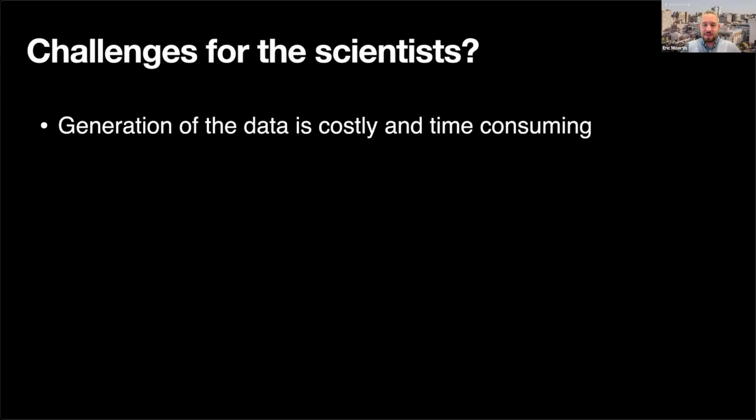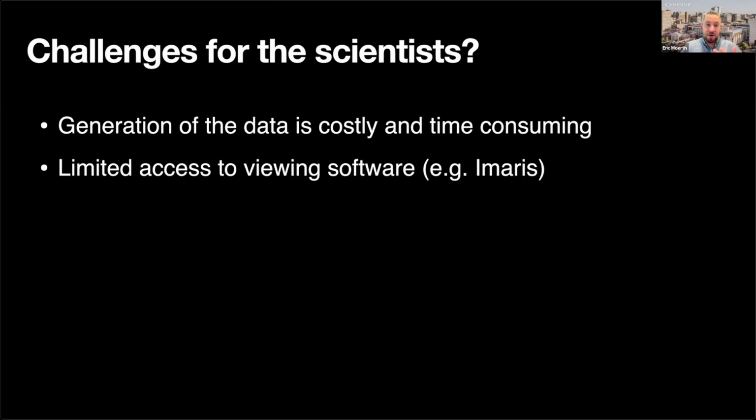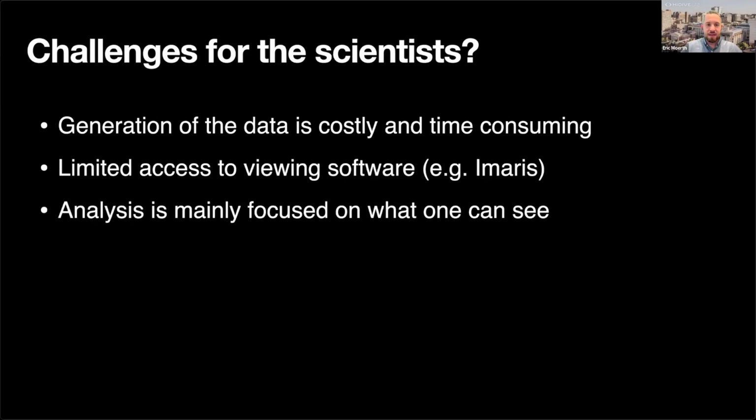First, of course, generating the data is costly and time consuming, but this might get better over time because microscopy technologies also get better. There's very limited access to viewing software. One of the big ones is Imaris, but those licenses are very costly and you need a powerful machine to use it. And of course, analysis is mainly focused on what one can see, right?